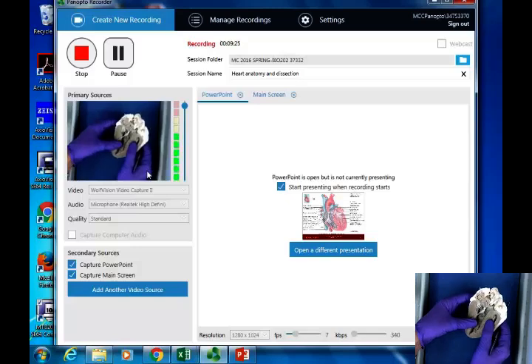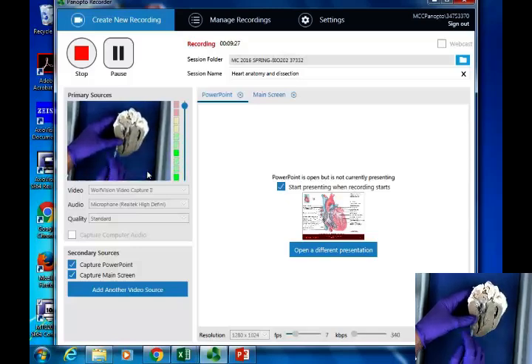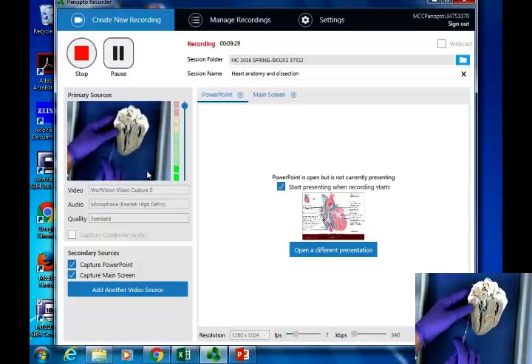All right, so that means this is the left atrioventricular valve, right? Because we know this is the left side. That means this is the left atrium up here. So we're just using that to navigate and see what we're able to identify. So left atrium, left AV valve, left ventricle. The blood comes in this way, and it actually goes out this way in a V-shaped pattern. That's very interesting. So it's called the ventricle. Doesn't have any influence, just coincidence, but still.